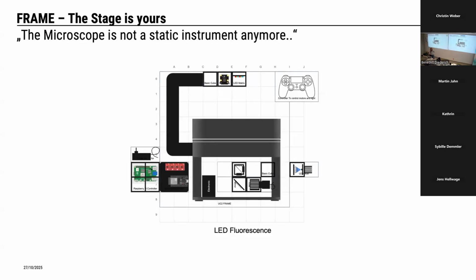Right, and how does it look like for a frame? So I've brought some of these inner cubes, and one challenge for today, once you've learned how to build this coreBOX smartphone microscope, you can start building a very simple microscope, but it's already a little bit advanced because it has the ability to detect polarization. For this, we have some components here. I haven't brought all the library cards, but two very important ones, which is the polarizer and the analyzer, which is here. And then, not sure, I think you cannot really see that.